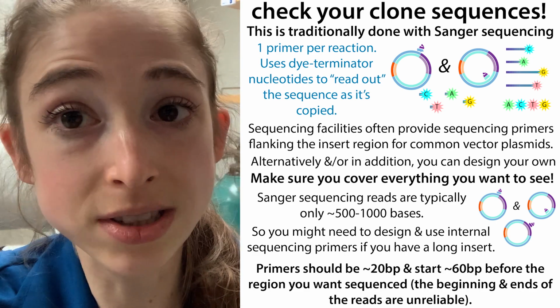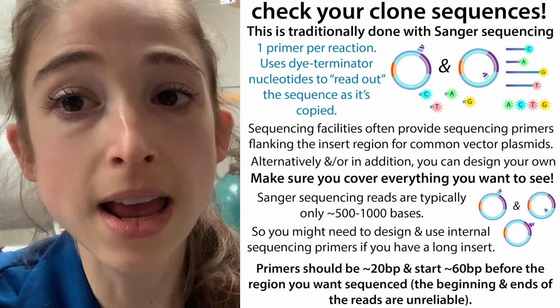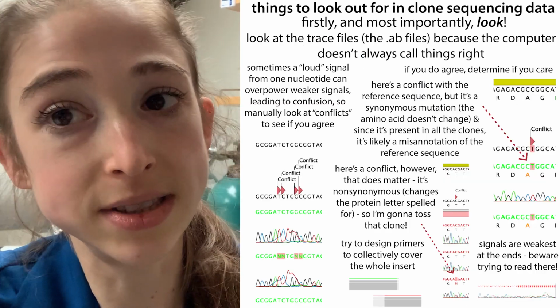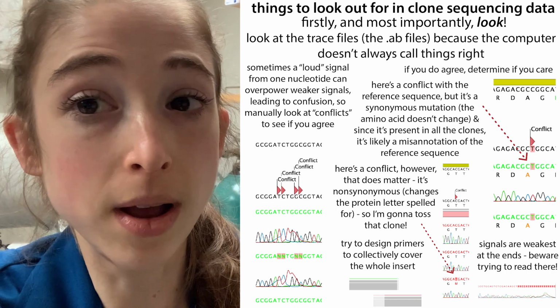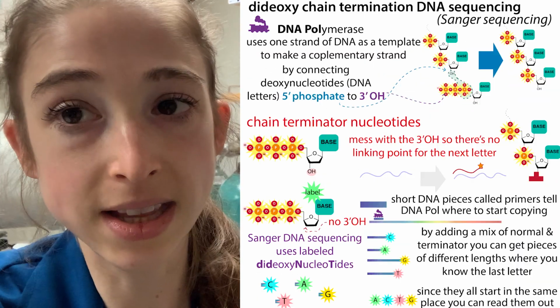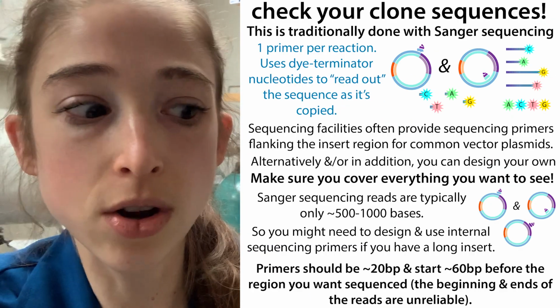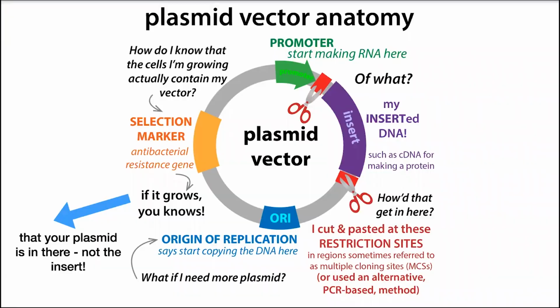And so today I want to talk about some of the practical details of sequencing plasmids, as well as analyzing the sequencing data. So mostly talking about Sanger sequencing and designing the primers for this, but you can also do whole plasmid sequencing. So let's get into the details. I'm just going to dive in. If you need more background, I have lots of other videos and posts that I will point you to.